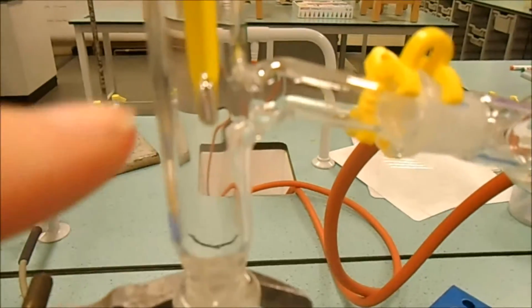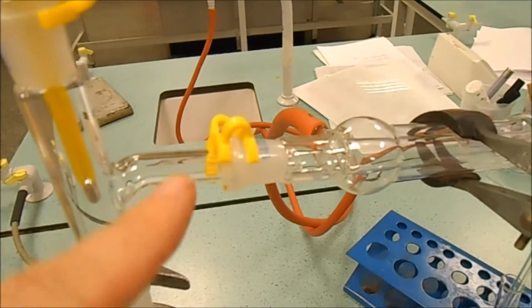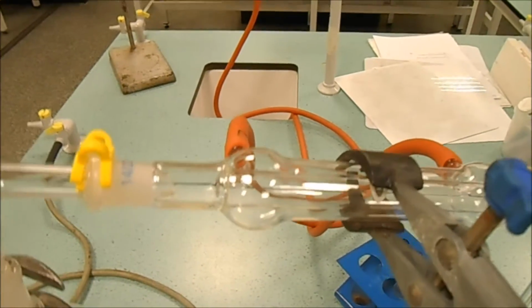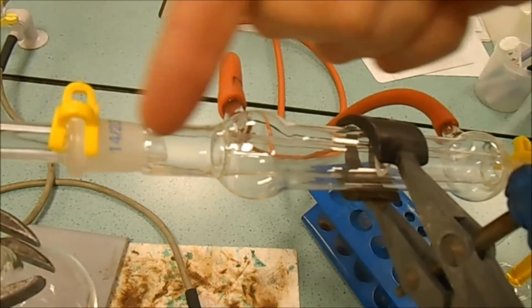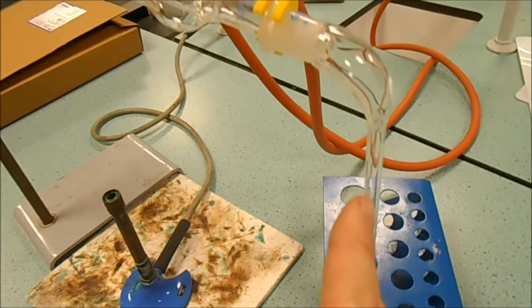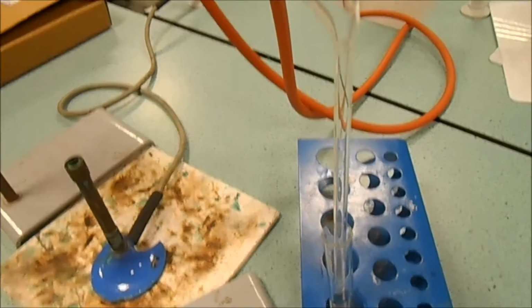The bottom of the thermometer has to be right here by the still head, and we have a clip to this condenser. Now the water here just goes round the outside of the tube. It's not going in the tube, it's going round the outside, and the idea is that that's going to cool down anything which comes through here. Over this end I've got a delivery tube into a test tube, and we're going to collect our aldehyde there.